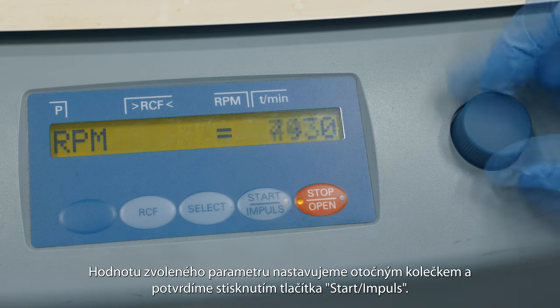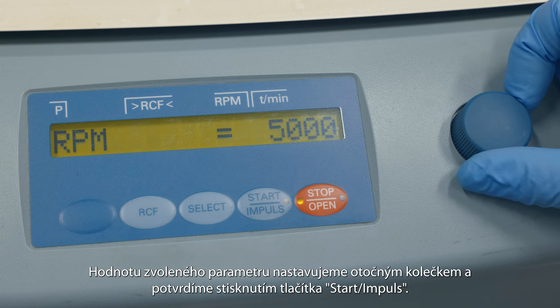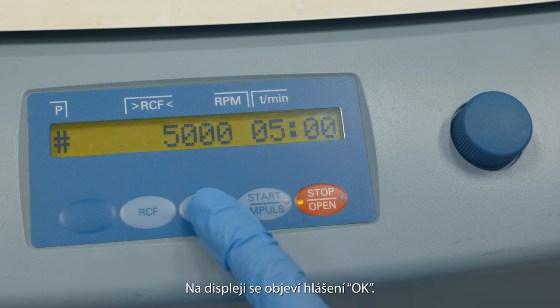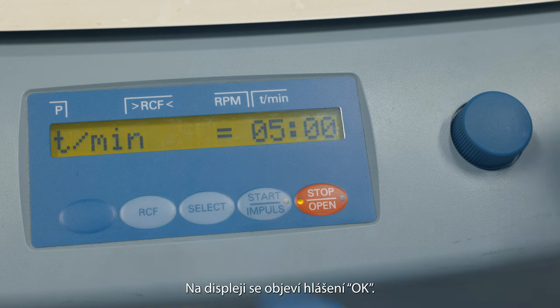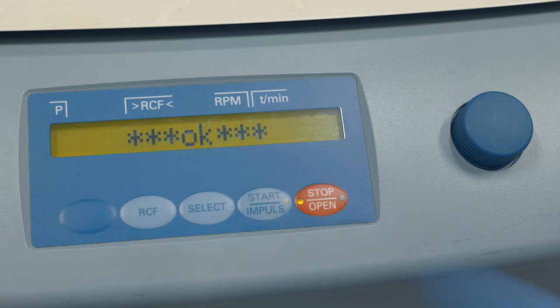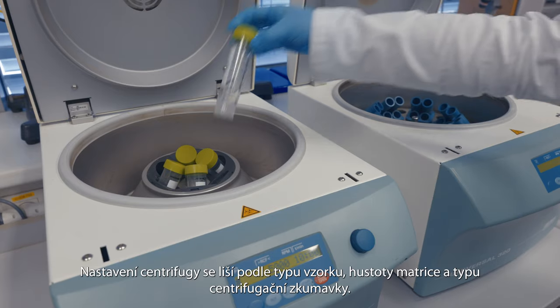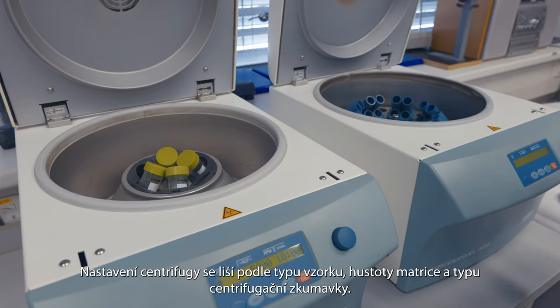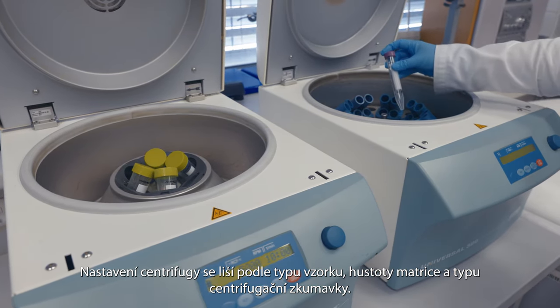The value of the selected parameter is set with the rotary wheel and confirmed by pressing the start/impulse button. The OK message appears on the display. Proceed in the same way to set the other parameters. Centrifuge settings vary according to sample type, matrix density, and centrifuge tube type.